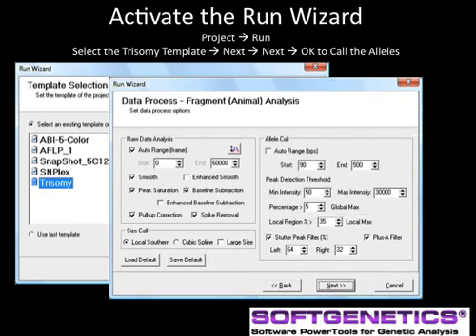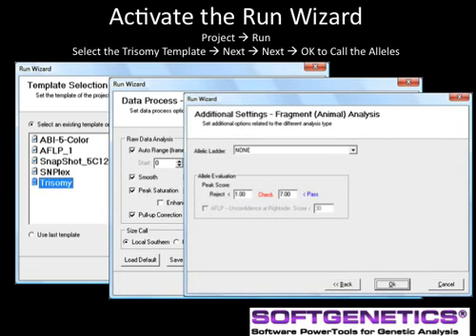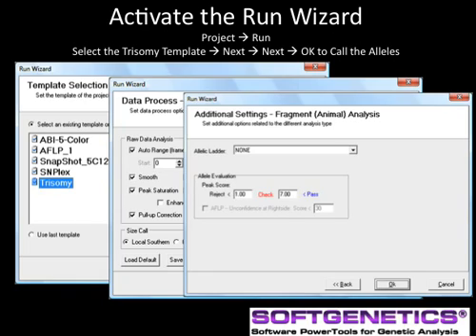Then apply the template by clicking on Next, Next, and OK. This template will apply analysis settings commonly used by many QFPCR users. For details on each parameter and information on customizing or creating new templates, please refer to the introductory GeneMarker webinar. All settings in the template may be customized and saved with the disk icon, avoiding repetitive selection of run parameters from one project to another.